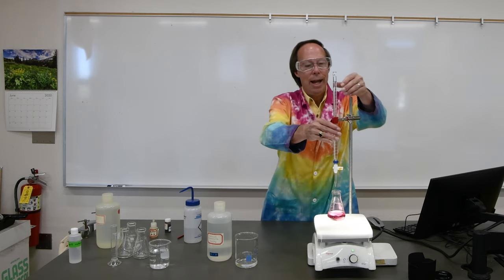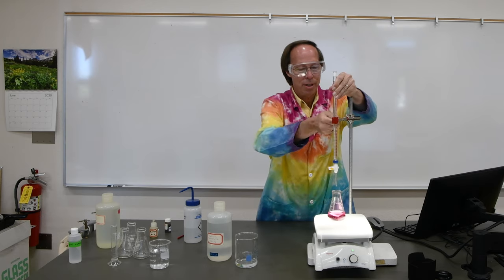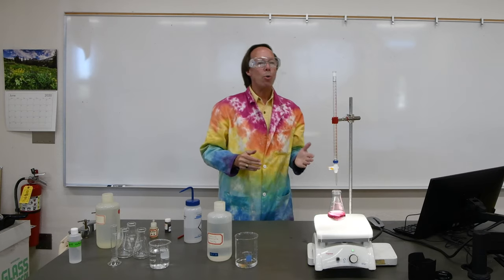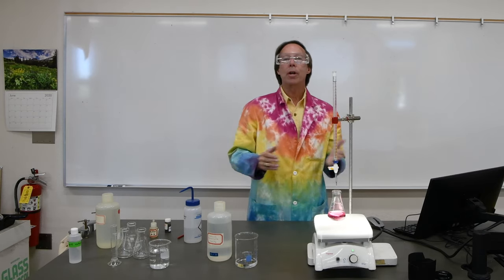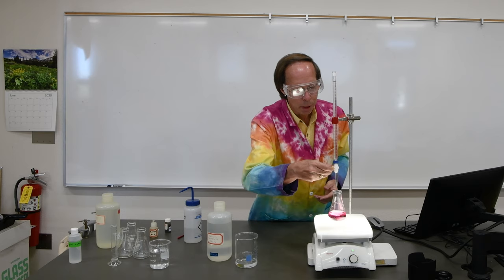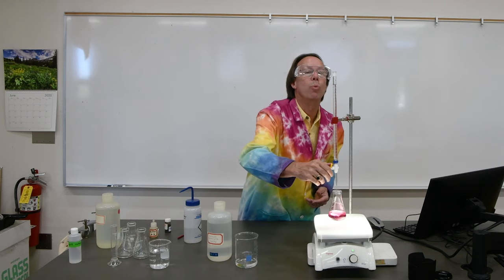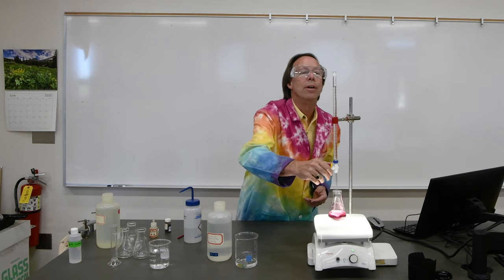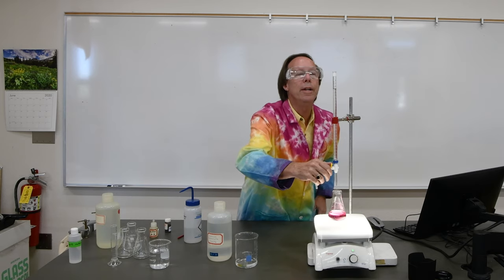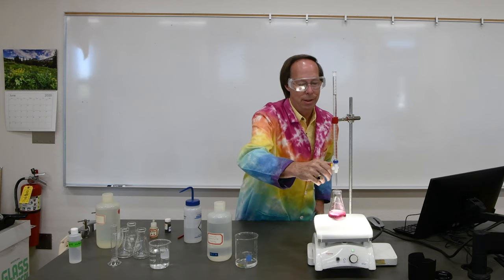So let's go ahead and begin to add the EDTA. I'm going to rotate this around to make it convenient to handle the stopcock. Now, when you're doing a titration, if you already have a good idea of where the color change should occur, you can add the titrant fairly quickly. So I'm going to start adding my EDTA solution. I know it should take about 6 milliliters or so. So there's 1 milliliter. There's 2, and notice it's still red. There's 3. When it gets close, I will slow down. There's 4. And there's 5.